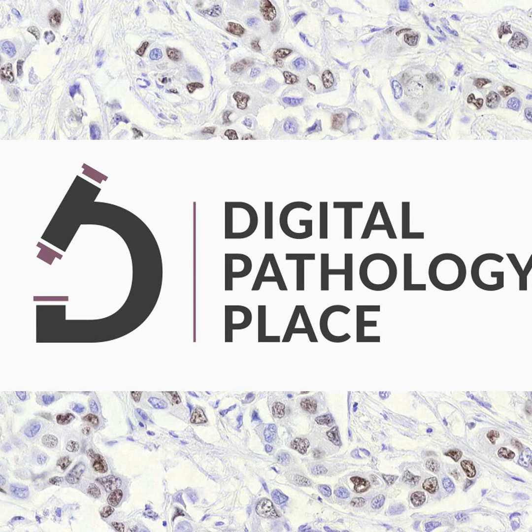So there's two places where you're going to deal with this. First is in cell segmentation, as we just mentioned. And yes, you can create rules for segmenting cells. And that has been done for a long time. It can be a challenge with rule-based assessments because you have to make concessions when you start making rules. And so you're going to get close to good cell segmentation, but it's never going to be as perfect as people are hoping it to be.